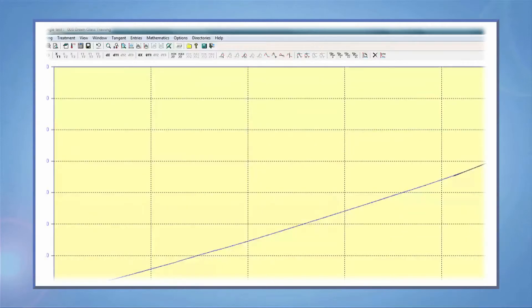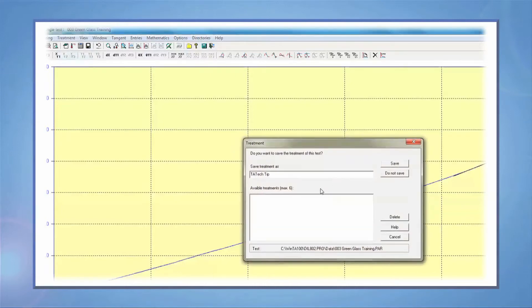If you want to save a specific analysis, you will need to go to treatment and save. You can save up to six treatments for every file.